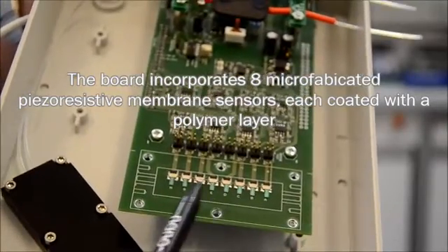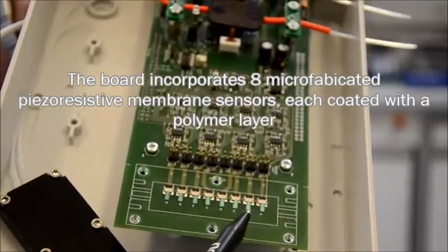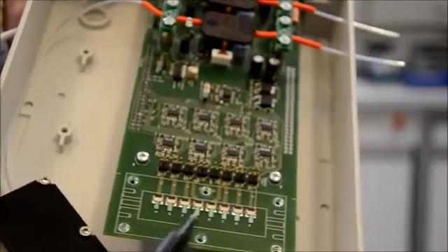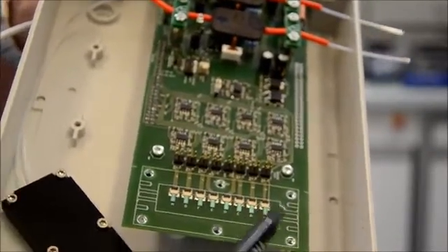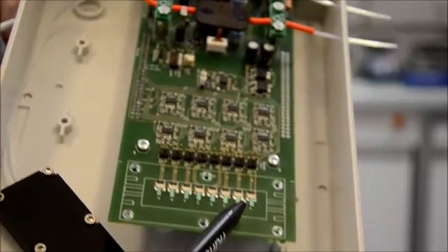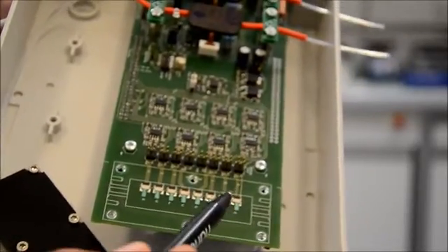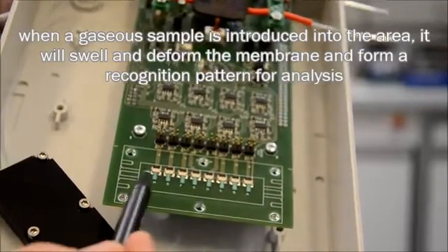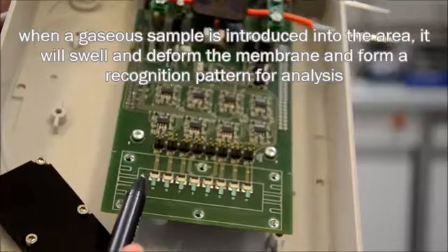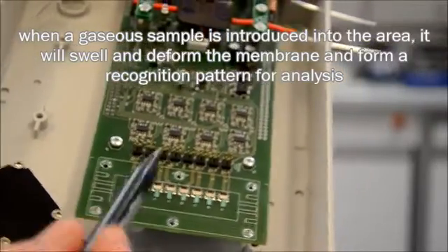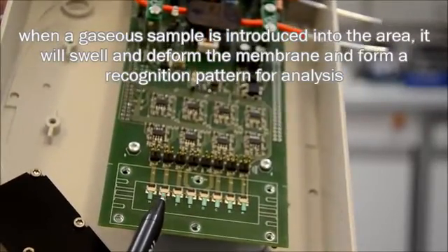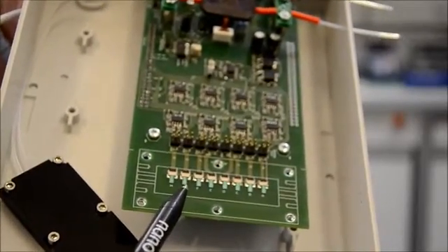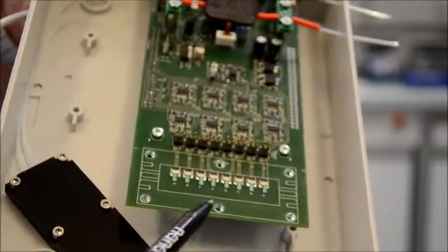Each one is modified with a polymer layer. And the gaseous sample will then diffuse into this polymer layer. It will swell and deform the membrane. That is our signal. And it is individual for each of these membranes. And from this recognition pattern, we can analyze the gaseous sample.